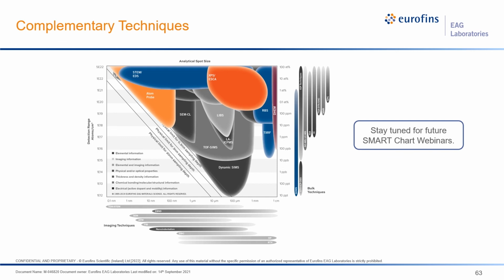Remember, in SIMS and semiconductors, you're measuring total elements. So you have no idea what percentage of these elements are actually activated. So you would need another technique like a Hall effect measurement that gives you a depth profile of the active dopants. We also use RBS and XRD to do matrix quantification and calibrate the SIMS intensities.